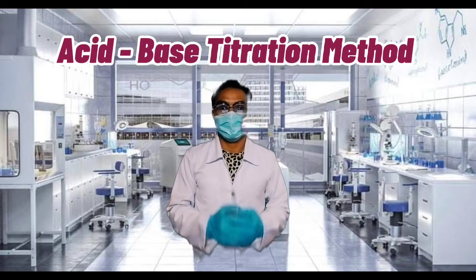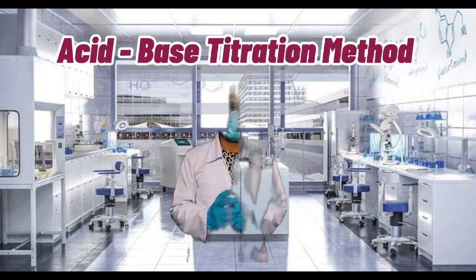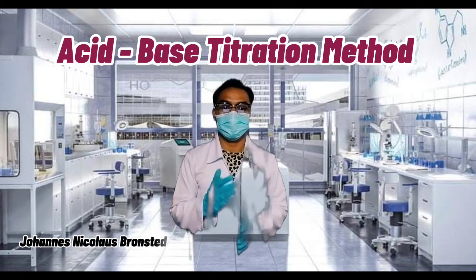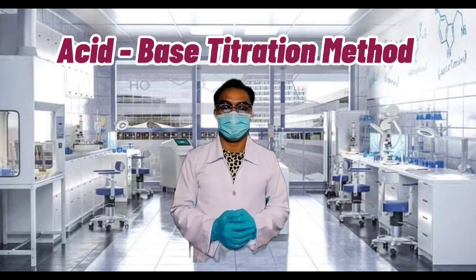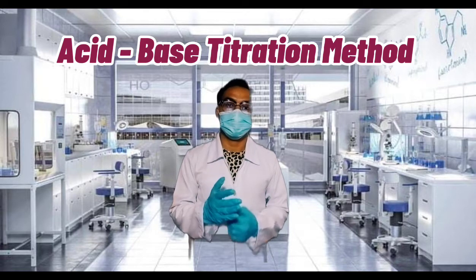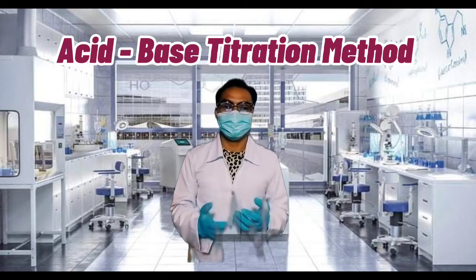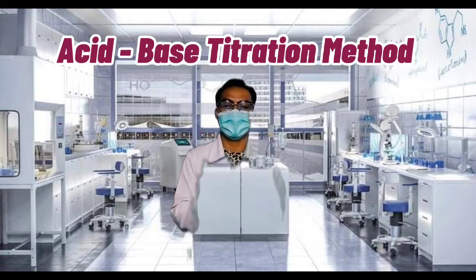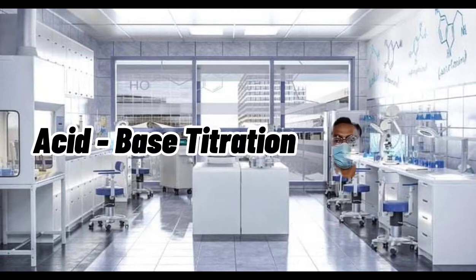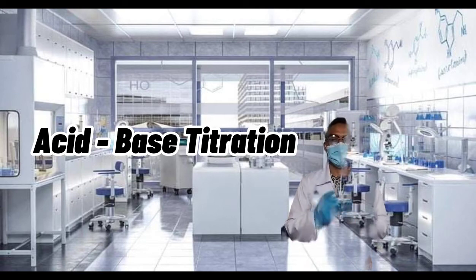Today we will tackle the acid-base titration method. The Bronsted-Lowry theory, also called the proton theory of acids and bases, is an acid-base reaction theory which was proposed independently by Johannes Nicolaus Bronsted and Thomas Martin Lowry in 1923. The fundamental concept of this theory is that when an acid and a base react with each other, the acid forms its conjugate base and the base forms its conjugate acid by exchange of a proton, the hydrogen cation, or H+.